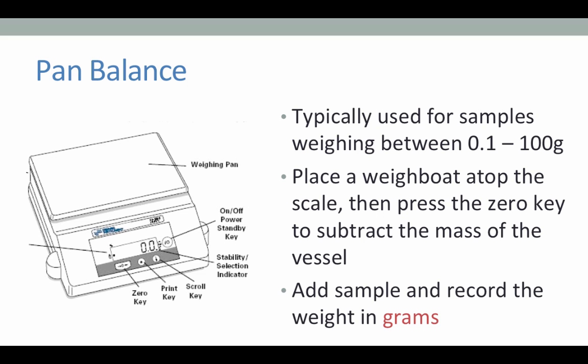A pan balance is one that you might be most familiar with. It resembles a scale that you might use in your kitchen, or perhaps a bathroom scale. It's typically used for items that weigh between 0.1 and 100 grams. This is because it measures down to 0.01 decimal places. Whenever we are using a piece of equipment that gives us a digital display, the last digit displayed is considered uncertain, as it is an approximation of the lower decimal places. So if we had an object which weighed 0.10 grams, then we are confident that it's at least 0.1 grams, and the 0 is an approximation of the last digit.